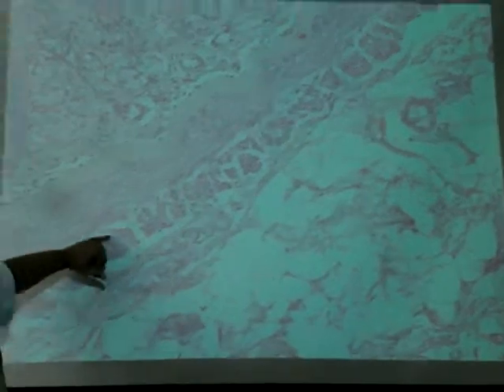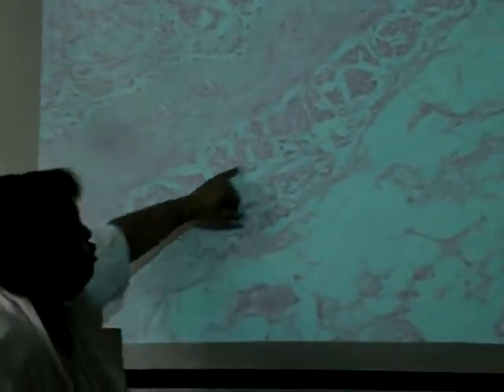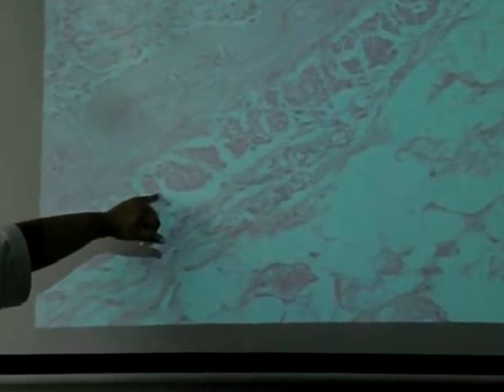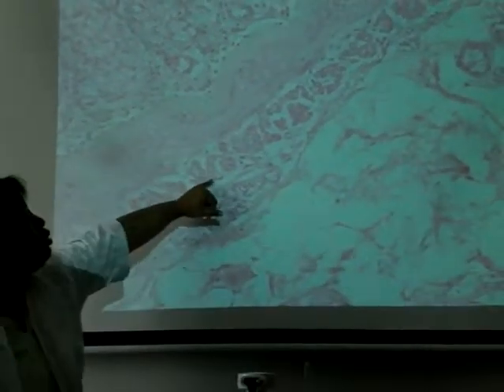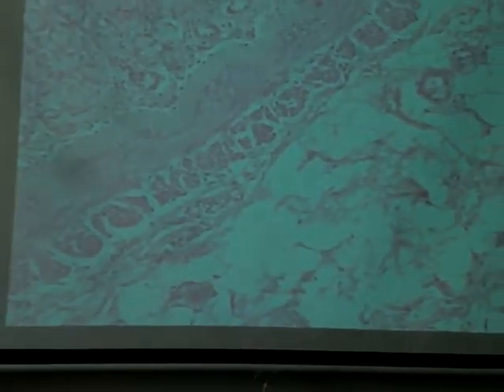Now below the muscle, here's more connective tissue again, and that will be the serosa. And serosa not only has connective tissue, it would have some epithelial also. Because again, this is actually the outer portion of the organ itself. You would know this as the visceral peritoneum. That's the other name for it. So it would be outside of the organ. That's serosa.